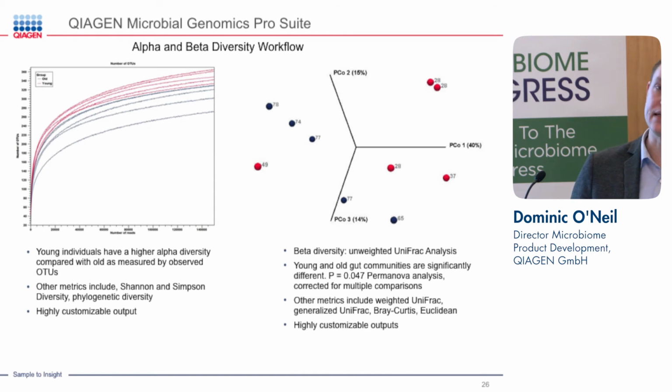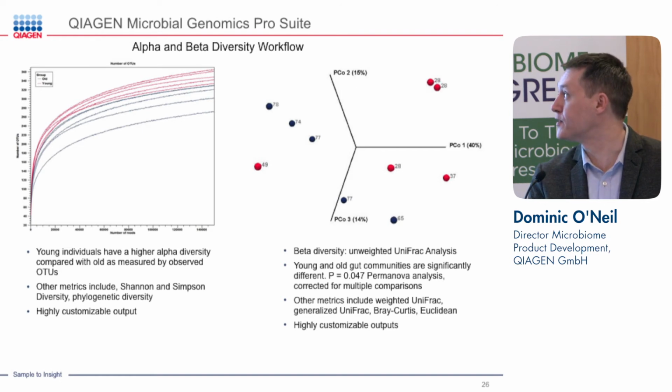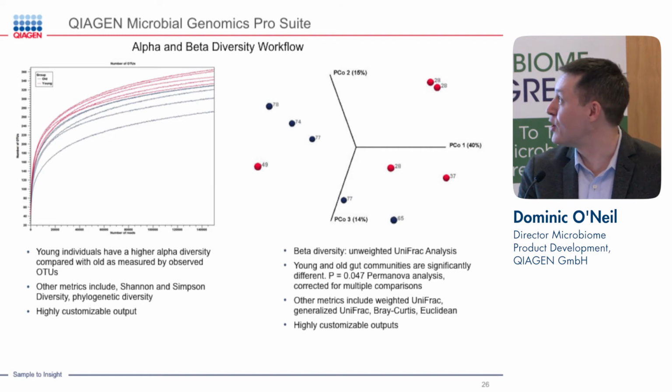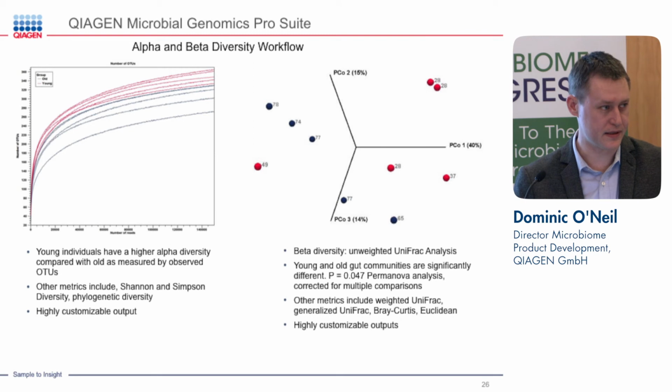It's notable that that is the old young sample at 49. So it could be that the arbitrary old-young split that we chose is at the wrong spot, or potentially that this individual has a microbiome that's undergoing a shift faster. Obviously there's not enough data here to say, but it's clear that this one is a bit of an outlier from all of these others.